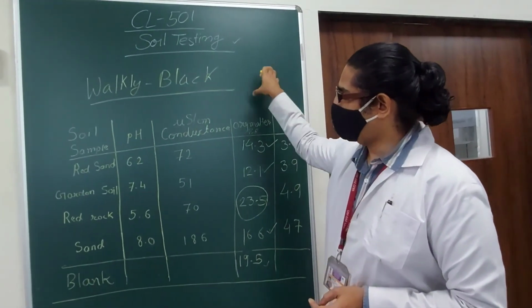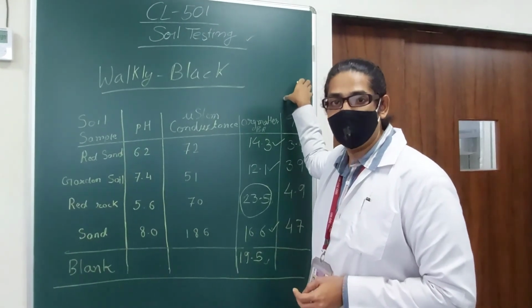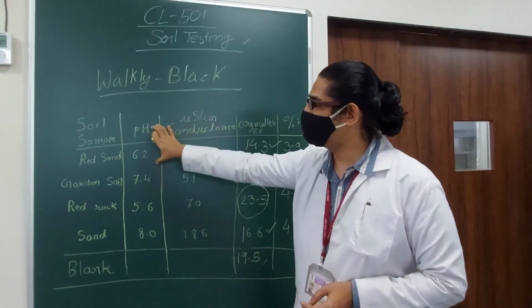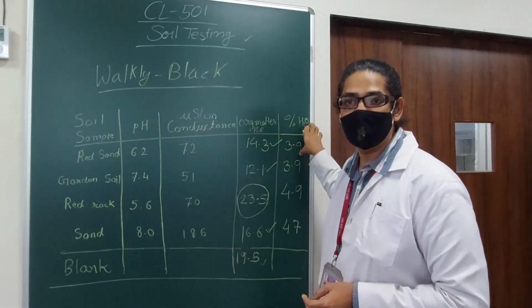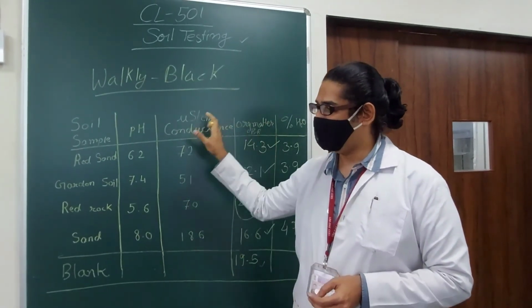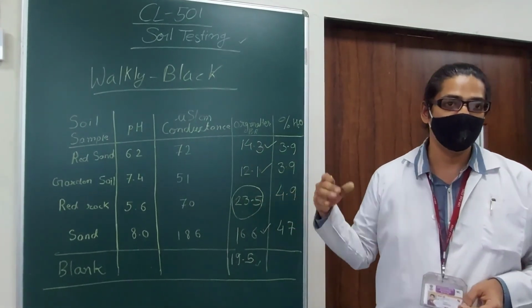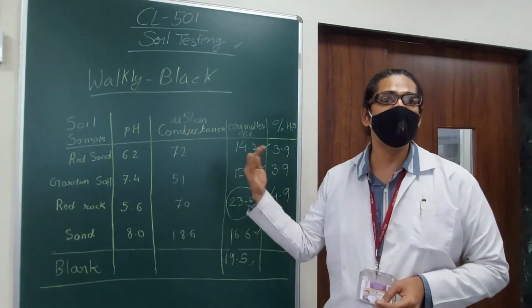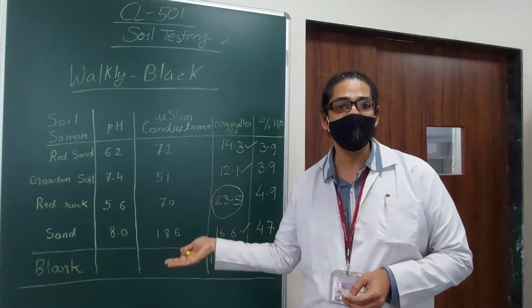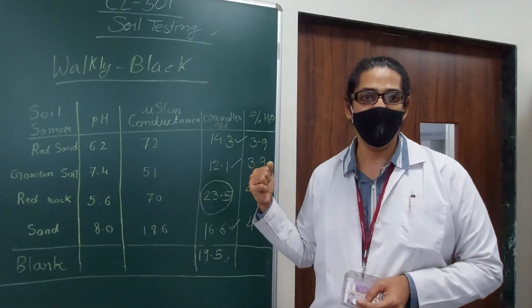But nitrogen, phosphorus, potassium, NPK, is very important in addition to these different parameters. Nevertheless, this particular practical serves its purpose, that all you had learned in the previous semesters can be put into use, the practical application in day-to-day life.